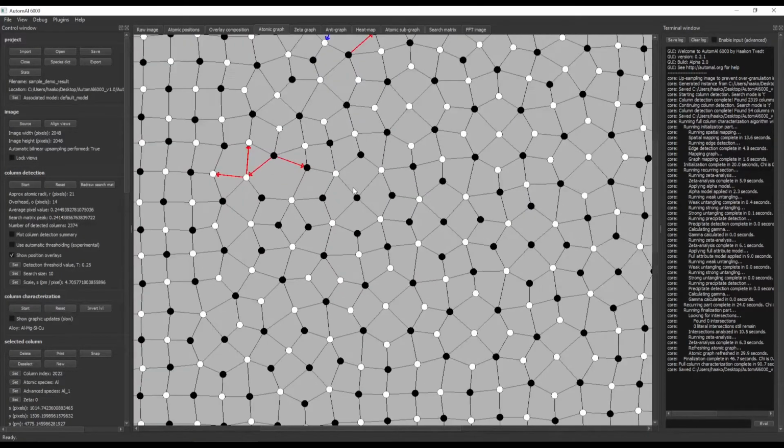This is where your knowledge of 6000 alloys is going to come into play. And this is a visual representation of the structure, and in my experience when showing this to colleagues, it's a bit of a steep learning curve, and it will take some getting used to.